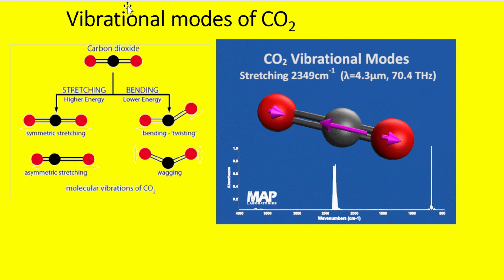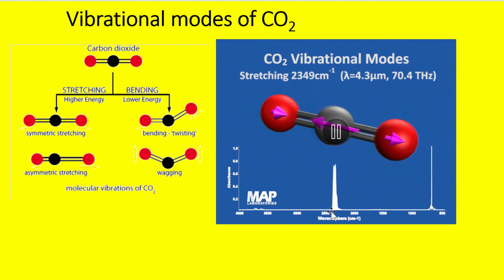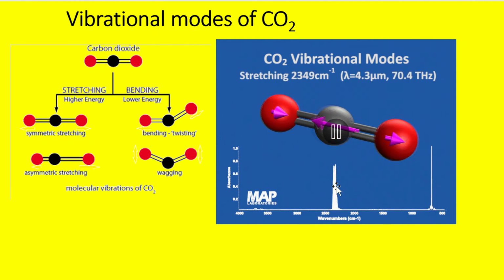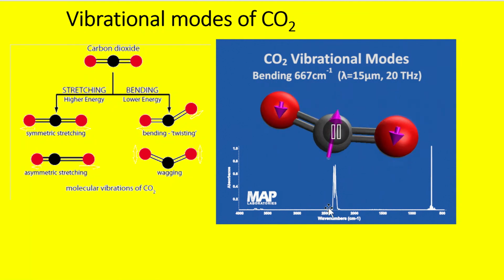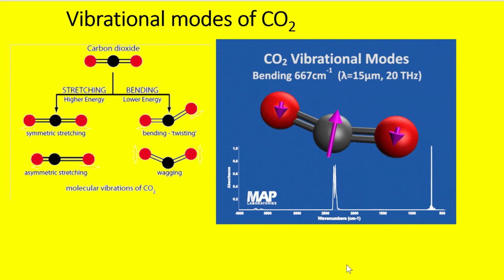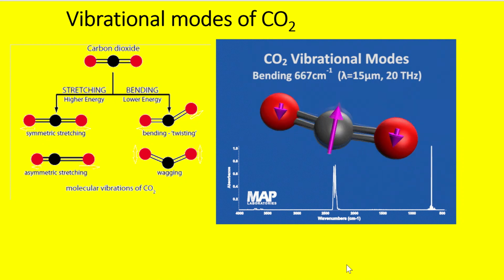I hope you're noticing that we have absorbance here and the movement correlates with it. Look at the difference. So the action links to a particular peak. And I know that we're not used to seeing an IR spectrum like this, but it's just for instructional purposes to see the stretching and the bending vibrations.